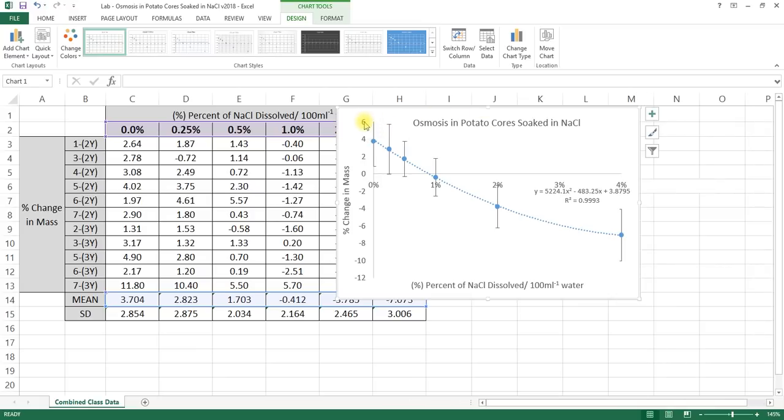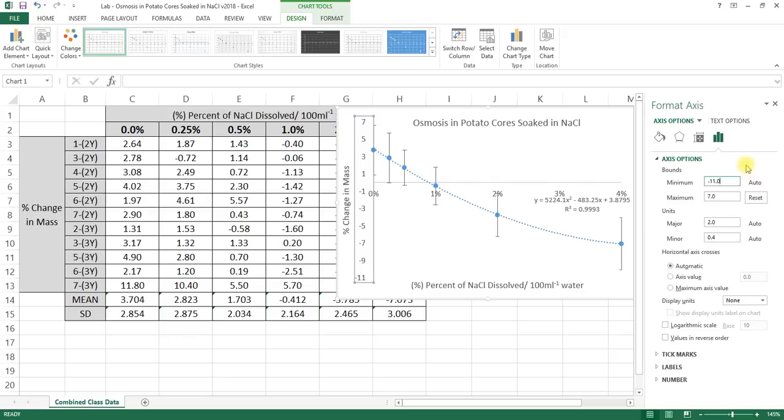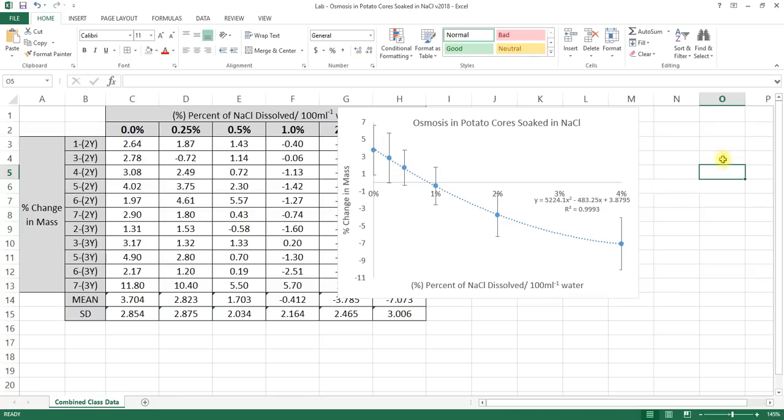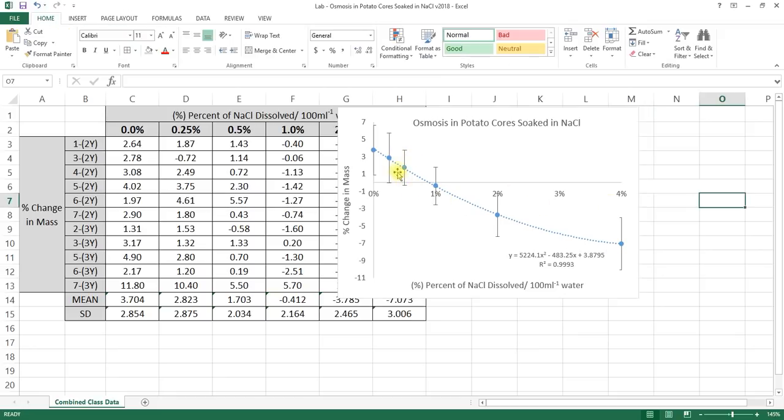And you will learn very quickly, Excel is a very picky software. You've got to click the right place, the right time. If you look at it wrong, it gets pretty ugly pretty fast. Alrighty, now I'm going to move this one more time here just so that it's in a better place. But if we look at it, it looks pretty good. We've got our error bars, which represent our standard deviation. And the wider the error bar, the more differences we had in our data.